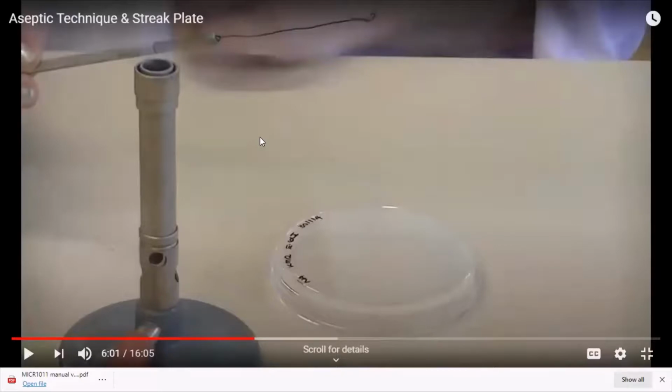Just for you guys to understand, a single colony would be like one of the little round bacteria spots that you would see growing on it. Don't worry, guys. As I said, this will all be reiterated and explained to you if you do biology, but I just want you to know from now. You can also do your own reading, or if you need help, I can always explain again.